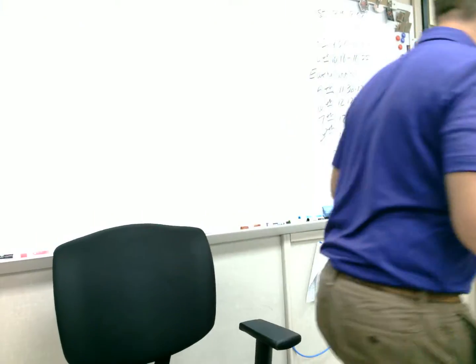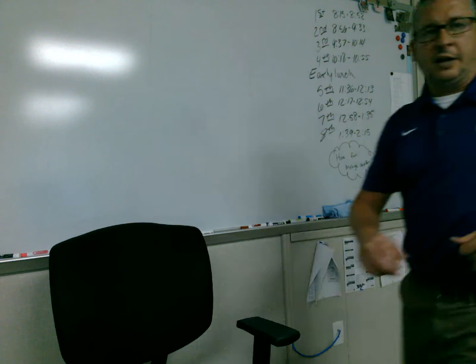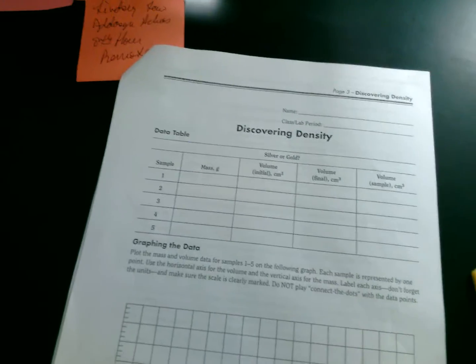You know what? I'm going to try to turn off some of these lights here. Hopefully that works out a little better, and I really hope we're able to see this. Okay. Oh, that's much better there.